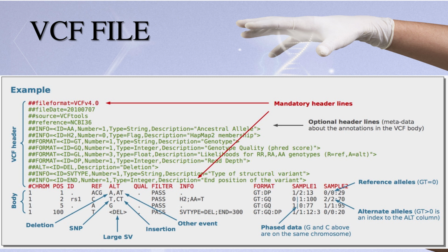Subsequently, a set of lines emerges, commencing with INFO, followed by another set starting with FILTER, and further lines initiated with FORMAT. Specifically, the lines beginning with INFO provide descriptions of annotations intended to characterize variant sites within our dataset. For instance, within the data lines corresponding to each variant site, details encompass the number of samples with data, total depth, allele frequency, and more.